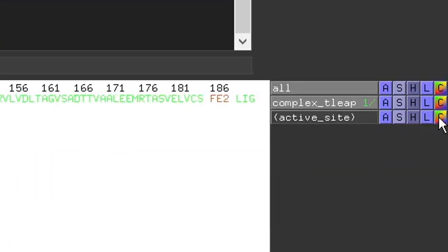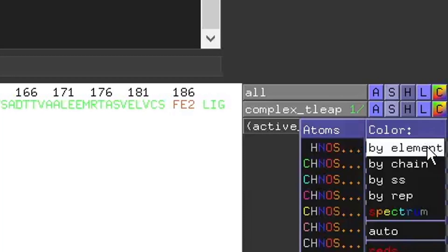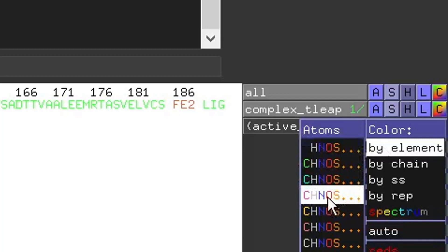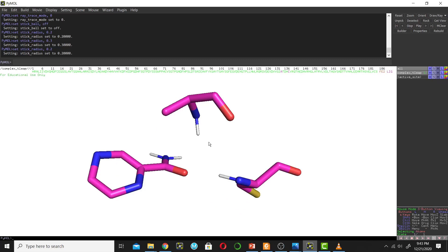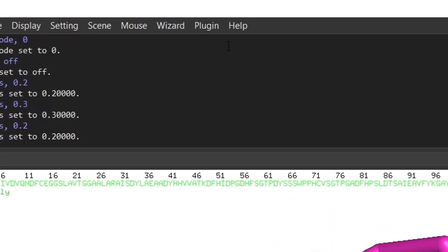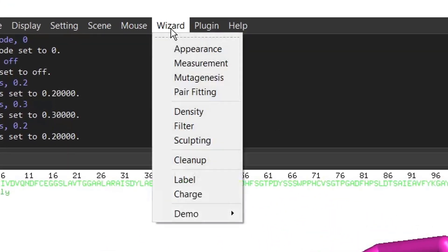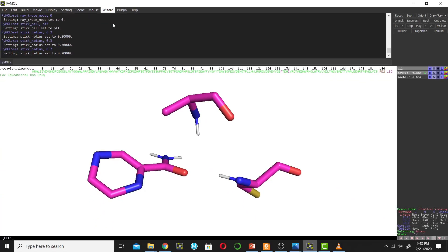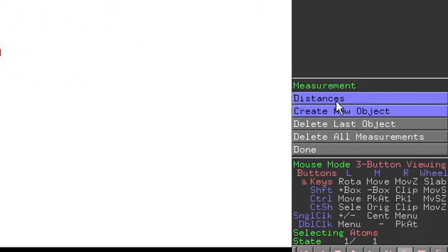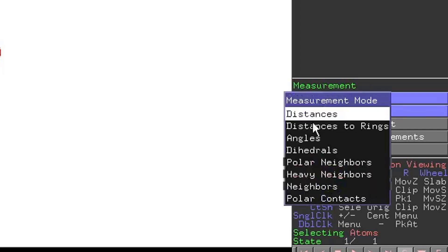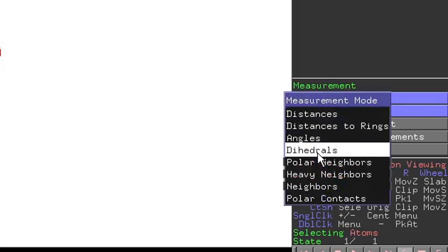Now I will change the color of the carbon atoms to match the reference picture, which uses magenta. Go next to active site, click the C button, choose Color by Element, and select the appropriate combination. Now I will draw a distance between the nitrogen atom of alanine 134 and the nitrogen atom of cysteine 138. Go to the Wizard tab and click Measurement.